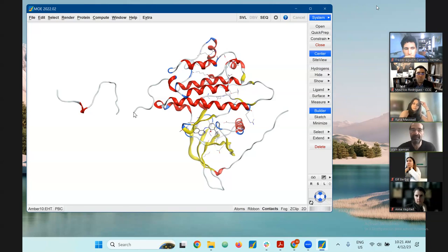And the reason for this is that if you look at the electron density of this structure, you'll notice that there won't be any electron density coverage in this region. And if there isn't any electron density, the crystallographer in this case, who was elucidating the structure, will not be able to model in the coordinates for it. There's no experimental evidence for it, and so he doesn't want to take the chance and just generate one.